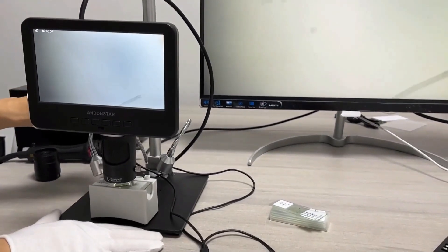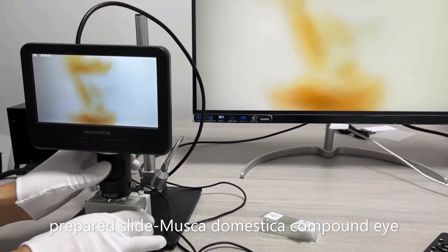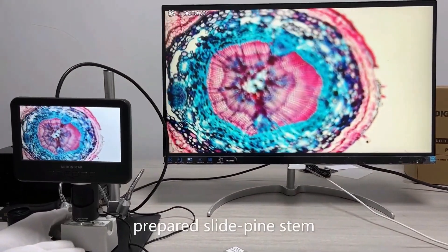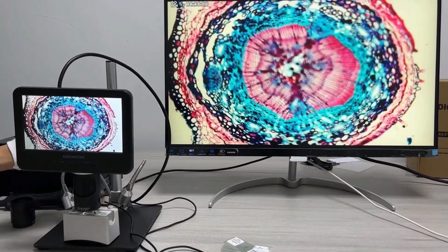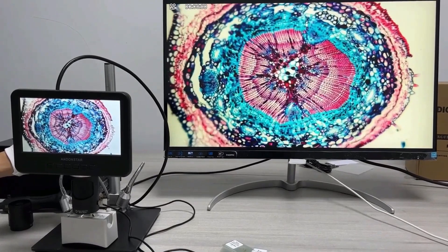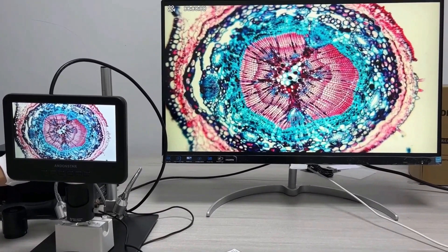Experience stunning detail with the digital microscope, which captures ultra high definition video. You can even connect it to a larger screen via HDMI, making it easier to see the tiniest details without straining your eyes. This feature opens up a whole new level of exploration in the microscopic realm.